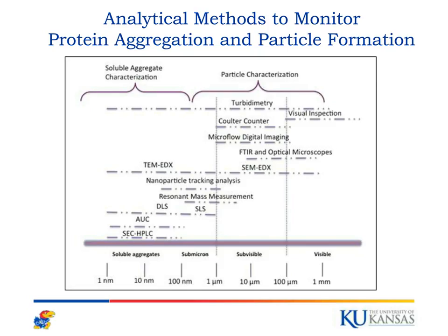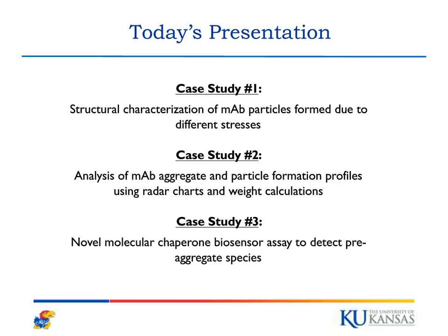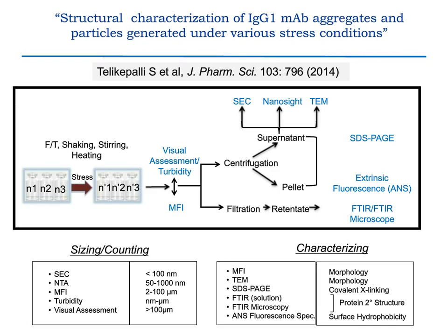So what I would like to do in today's presentation is go through three case studies from our lab that are going to look at different aspects of protein aggregation and particle formation. The first case study is entitled Structural Characterization of IgG mAb Aggregates and Particles Generated Under Various Stress Conditions, and it was published in 2014 in J Pharm Sci.